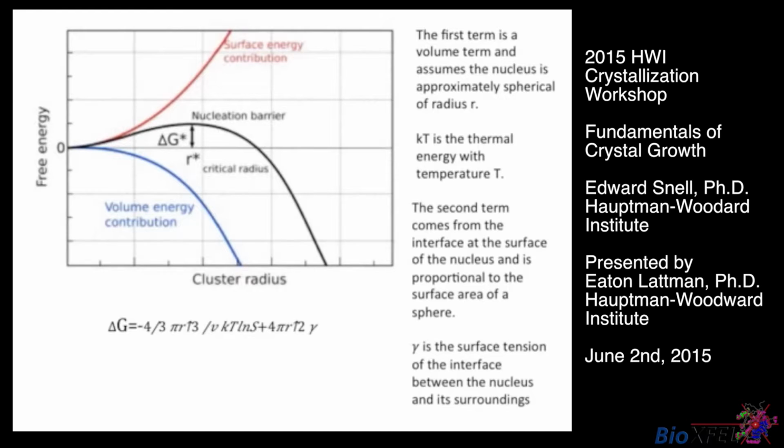It's always opposing formation of crystals, and that's because solvent competes with protein molecules for binding sites on proteins. So if you want to make a protein-protein contact in a crystal, that molecule has to be desolvated in order to make a protein-protein contact. The molecules on the surface are not being desolvated. They're, in fact, being pulled away.